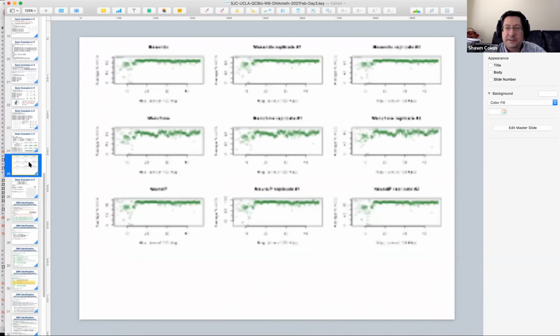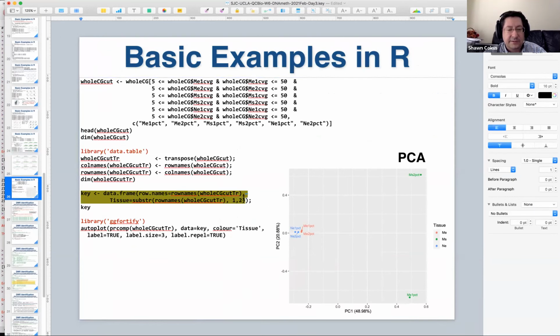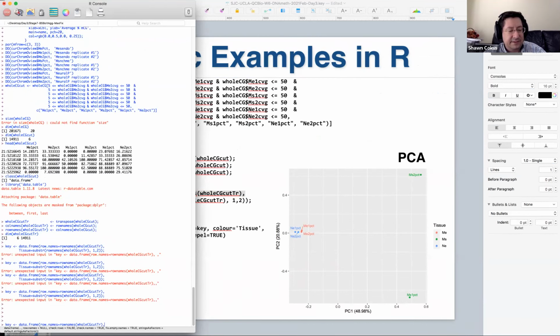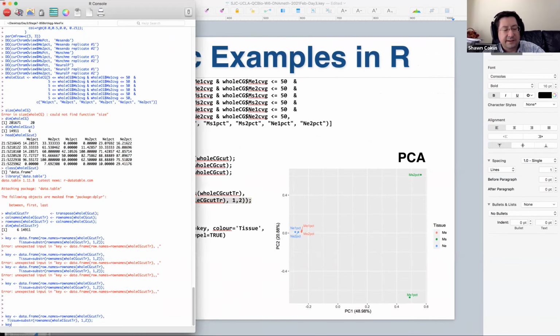Not there yet. Almost there. There we go. All right, I'm just going to try line 1 and line 2. There's something funny going on there. Okay. All right, got a plus sign for line continuation. That's good. It's not too unhappy yet. All right, that works. Okay.